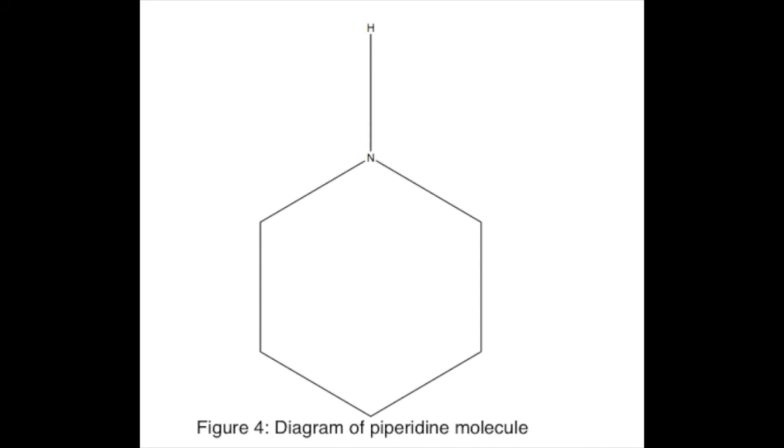Because the compound was soluble in water with a high pH above 8 and odors consistent with the description of amines, it was most likely that this was a functional group present. After performing the Hinsberg functional group test on the experimental compound, it was evident that a secondary amine was present. Using the solid derivative document provided, the appropriate derivative was narrowed down to two options. The boiling point of the derivative was considered when selecting a compound, and the unknown was successfully determined as piperidine.